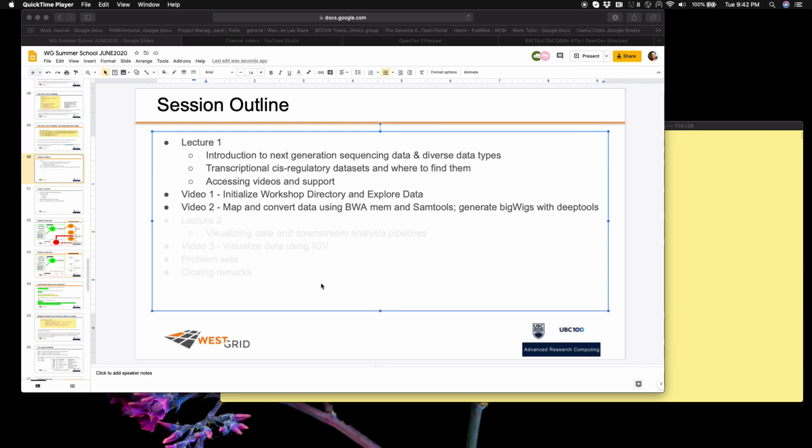My name's Phil Richmond, and we just went through a lecture where we did an introduction to next generation sequencing data and diverse data types, looked at transcriptional cis-regulatory data sets and where to find them, how to access the videos and support. In video 1, we initialized our workshop directory and copied some scripts into that directory. And in this video, video 2, we are going to go through the mapping and data conversion using BWA-MEM and SAM tools. We will also generate bigwigs for visualization with deep tools.